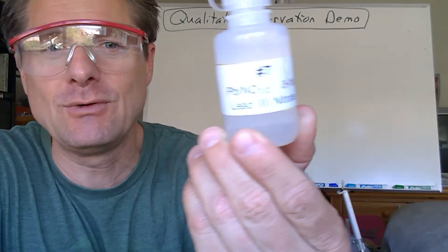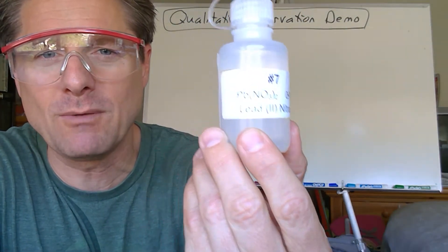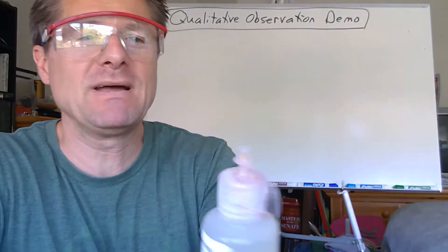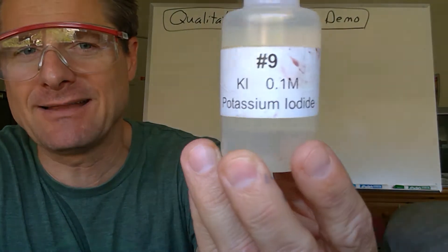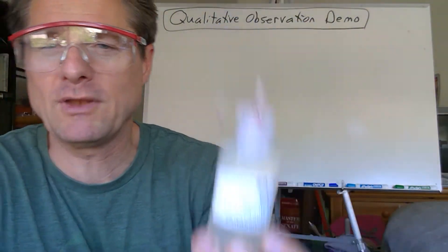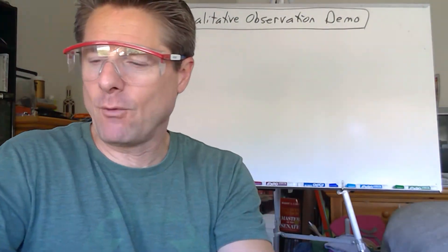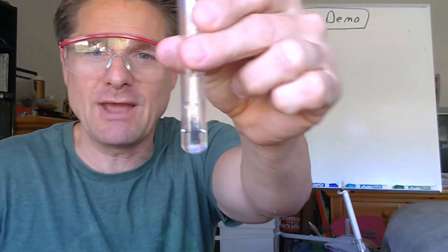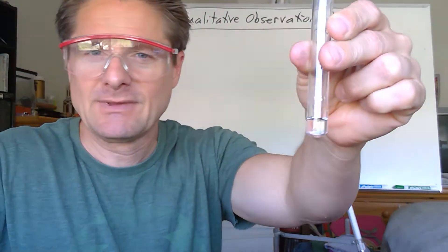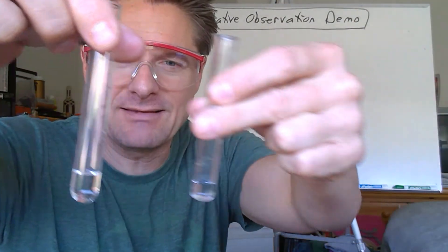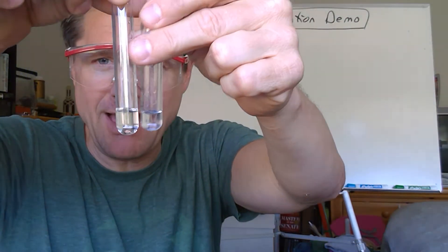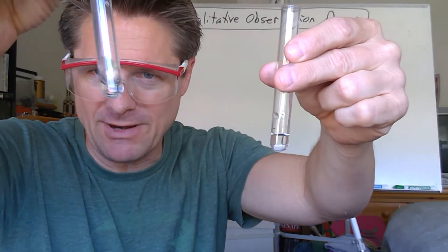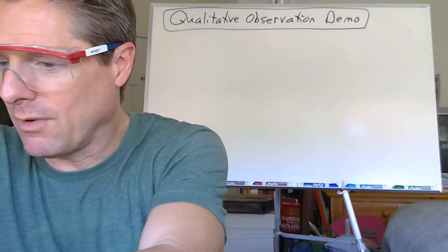So what we're going to do is mix some lead(II) nitrate solution — 0.1 molar — and some potassium iodide solution, also 0.1 molar. I've already put these into test tubes. Here's the lead(II) nitrate solution and here's the potassium iodide solution. The volumes aren't quite the same, so I'm going to pour a little out to equalize them.